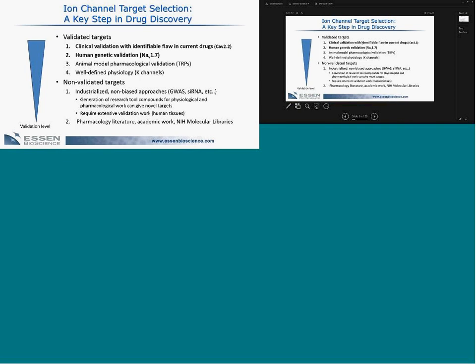Most high throughput screens and a lot of drug discovery in ion channels is supported by fluorescent assays. The throughput is probably the highest of all the other types of assays, and the information content can actually be pretty good. Sort of descending in the information content scale, you go to ion flux assays and binding assays, which are falling to some degree out of favor recently. So I think that in past years, when people wanted to do real high throughput screening, you were basically stuck with fluorescent assays. But as the trend has moved towards smaller focus libraries, I think you can use automated electrophysiology instruments to address those kinds of libraries.